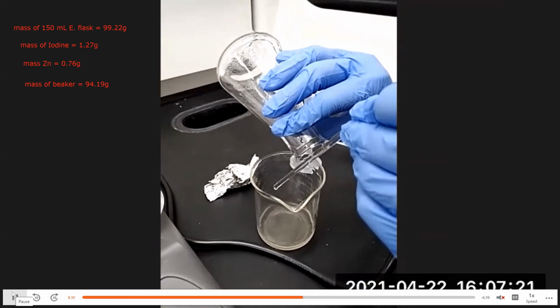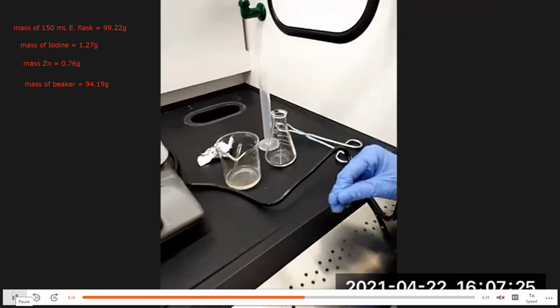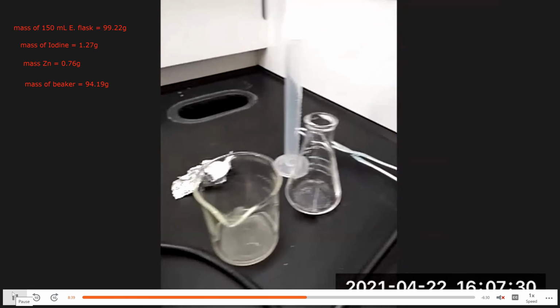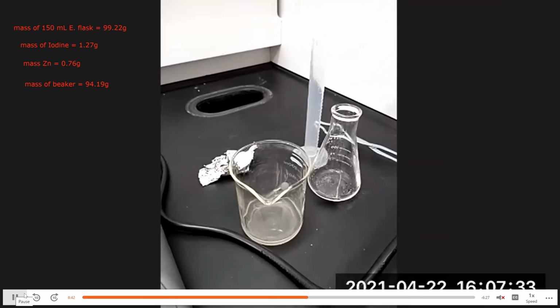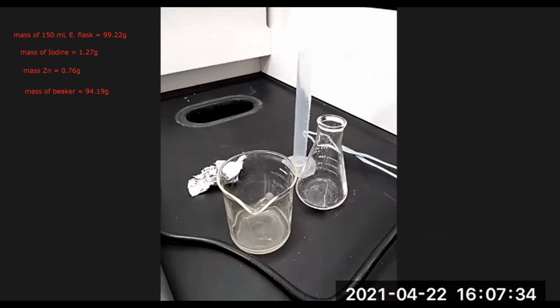Now, once we're done with the washing, we're going to put both the Erlenmeyer flask and the beaker on the hot plate. In the Erlenmeyer flask is our unreacted zinc, and in the beaker is the product in solution.